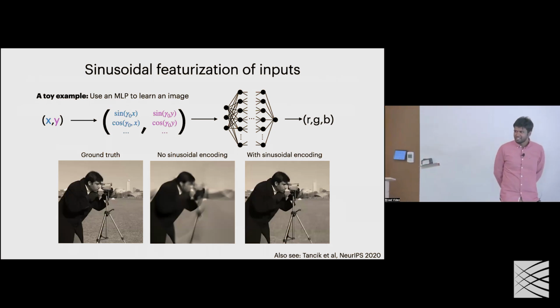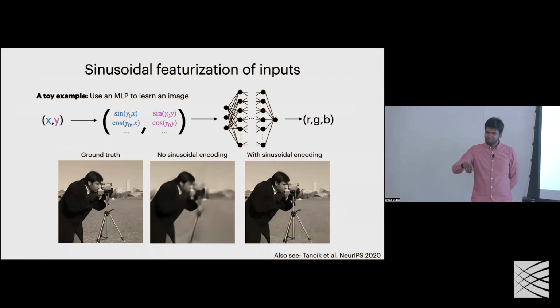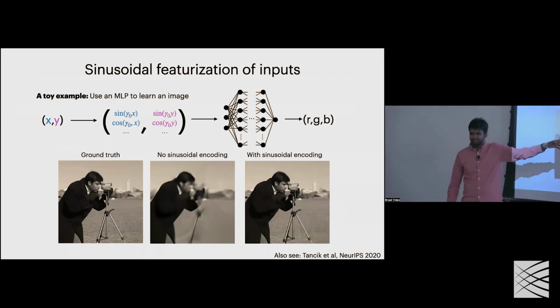I think it's not exactly. It's similar in the sense that you're transforming into a set of sinusoids. It's not a direct Fourier transformation. We're not adding them. For the coefficients of all those Fourier components, there are different choices you can make, but by default, we just draw them from a Gaussian. So the coefficients of all those different sinusoids are sort of random. They don't correspond to the actual Fourier.